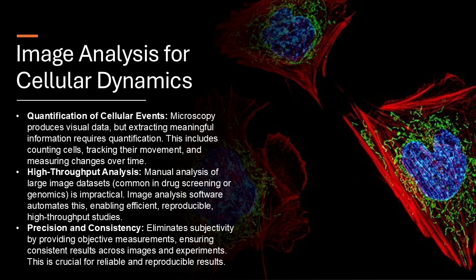So how do we get from the picture to usable data? Well, that's where the software comes in. And these tools help us measure and quantify everything. So instead of just seeing the cell move, we can get hard numbers. Exactly. And answer questions we could only dream of before. Like what kind of questions? Like, how does a certain drug affect cancer cells? Or how do immune cells migrate?